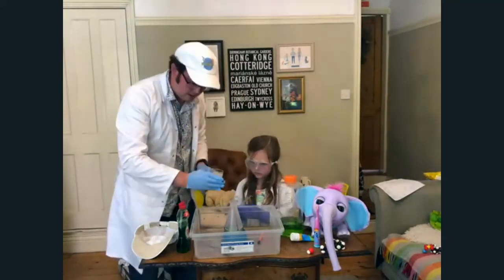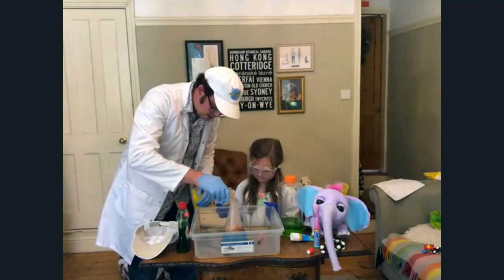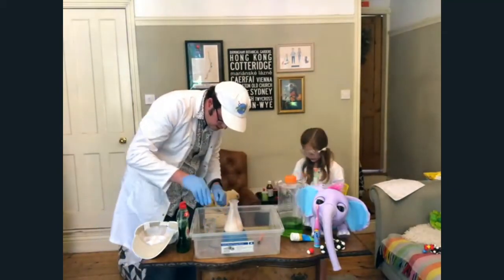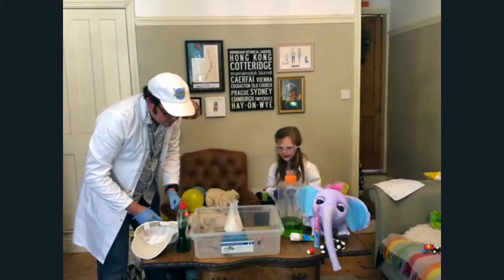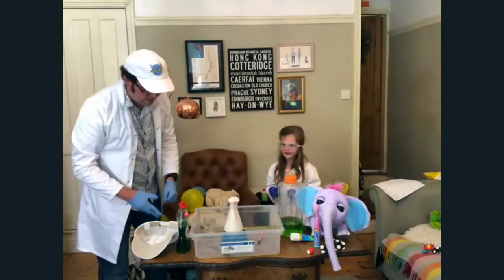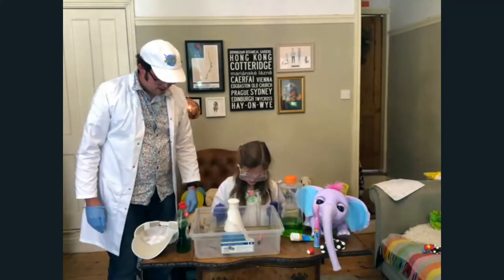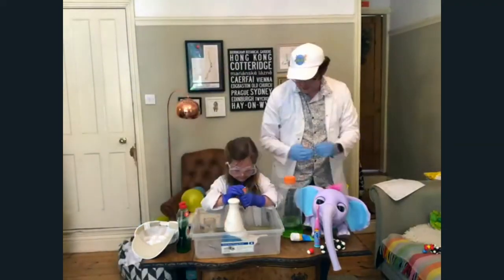So hopefully this is yeast in here. You can put that in. And then stand back a bit, it's coming. Here we go. There you go, Bex, you've made some elephant toothpaste there. Luckily it hasn't gone everywhere, otherwise that would be a disaster, wouldn't it?